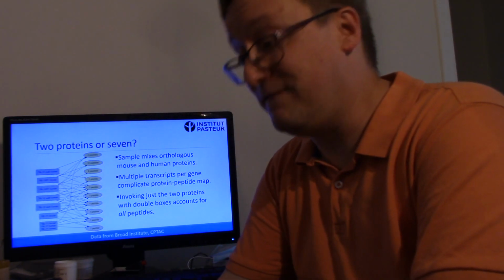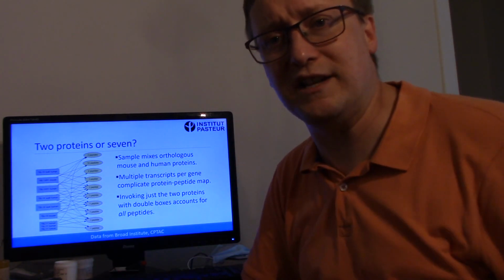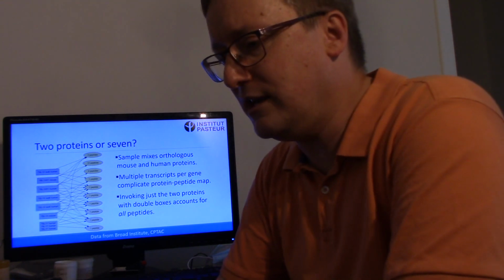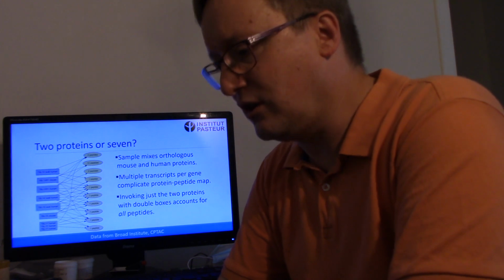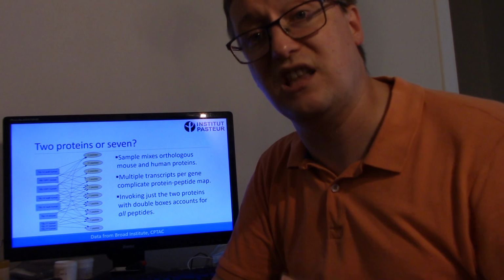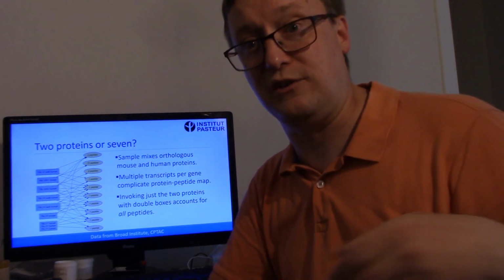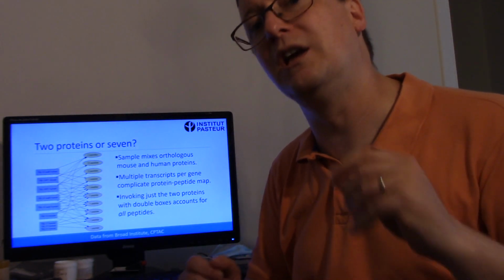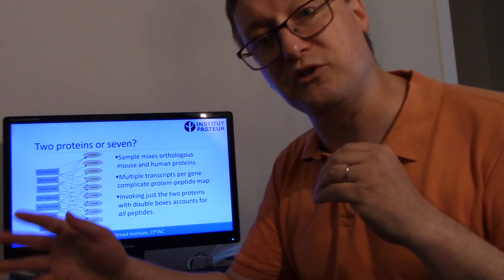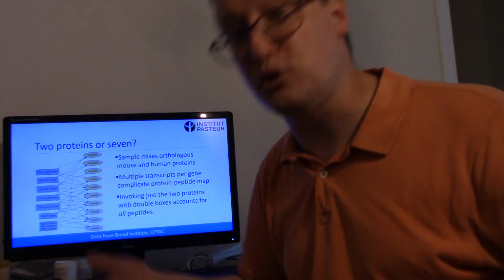Sometimes these situations get very badly out of hand. My friend Carl Klauser over at Broad Institute provided some really great data from something called a xenograft. In this case, we had a human breast cancer tissue that was injected into mice, and the mice then developed tumors. But those tumors contain both human cells that are proliferating rapidly inside the mouse, along with some mouse material itself. So there's a mix of mouse protein and human protein, as well as isoforms and gene duplicates that exist within these species.